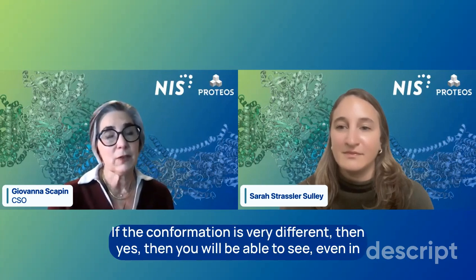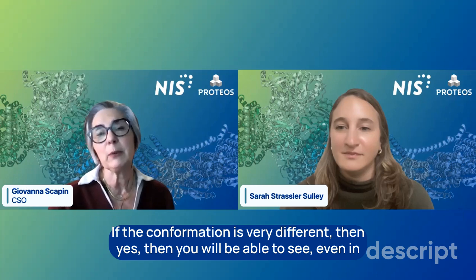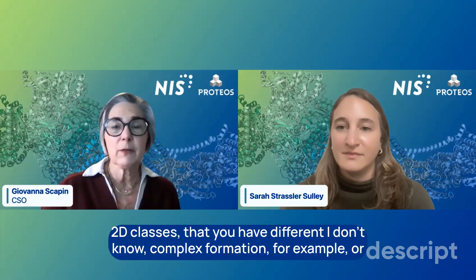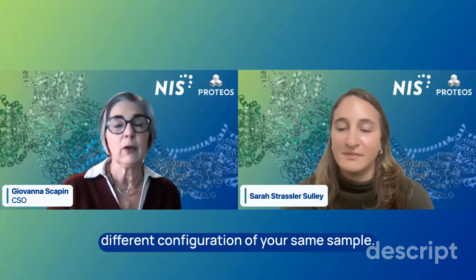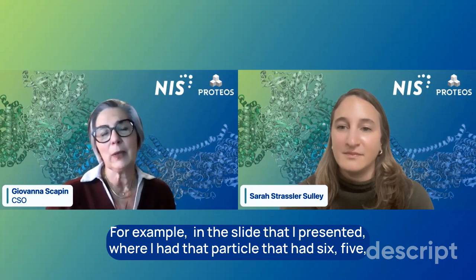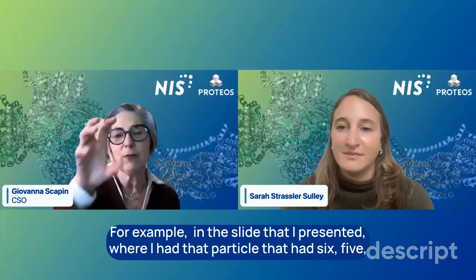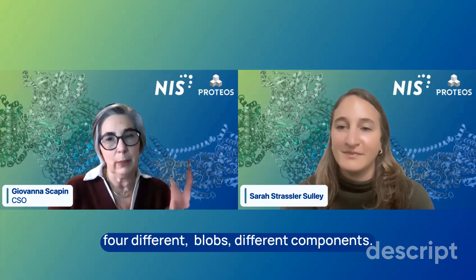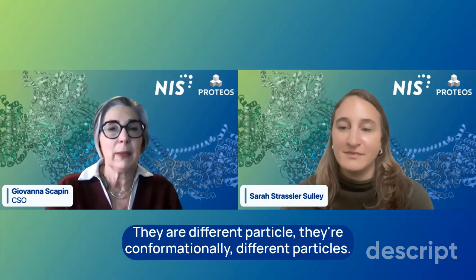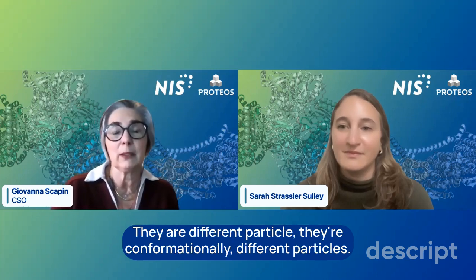If the conformation is very different, then yes, you will be able to see, even in 2D classes, that you have different complex formation, for example, or different configuration of your sample. For example, in the slide that I presented, where I had that particle that had different blobs, different components, you can see that. That's definitely not different views. They are different particles. They are conformationally different particles.